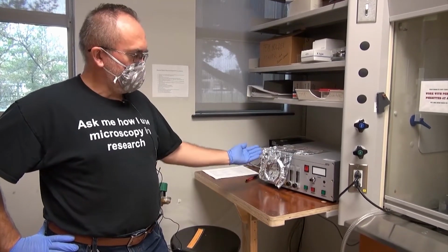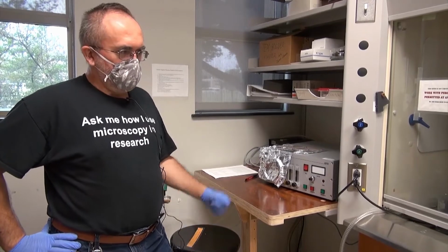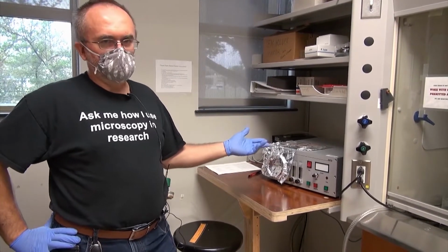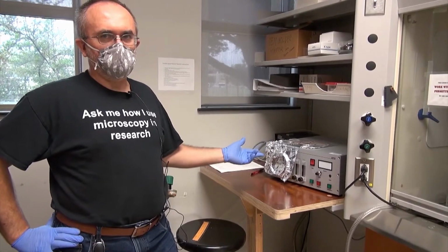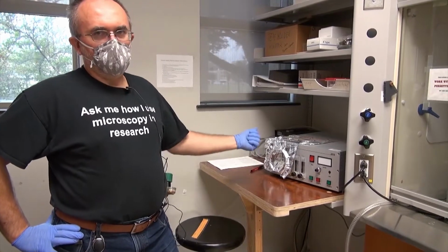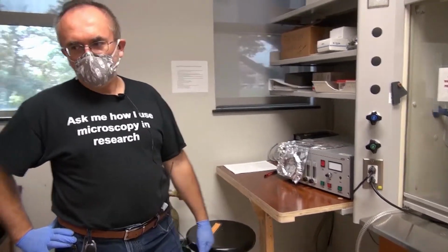We can also use this machine for activating surfaces, for cleaning glass slides or cover slips for high-resolution optical microscopy, and also for cleaning TEM holders to remove contamination.